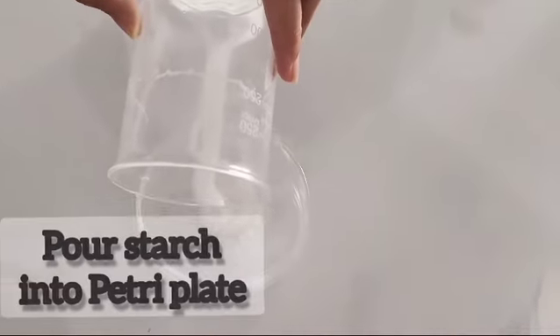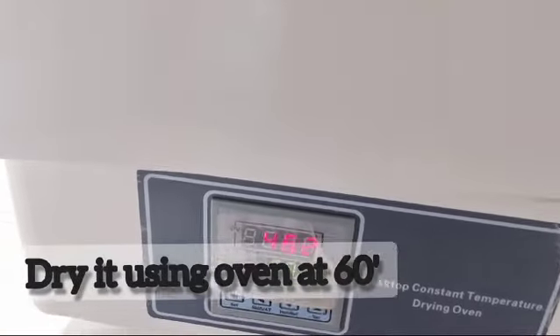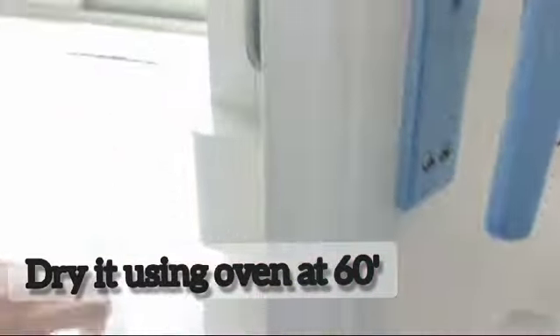Pour the starch into the petri dish. Now, dry the starch. Set the temperature to 60 degrees.